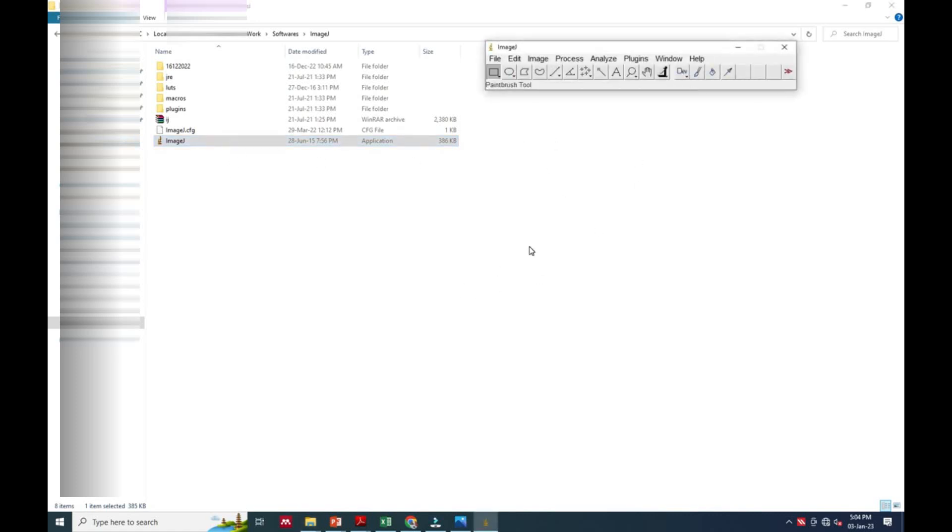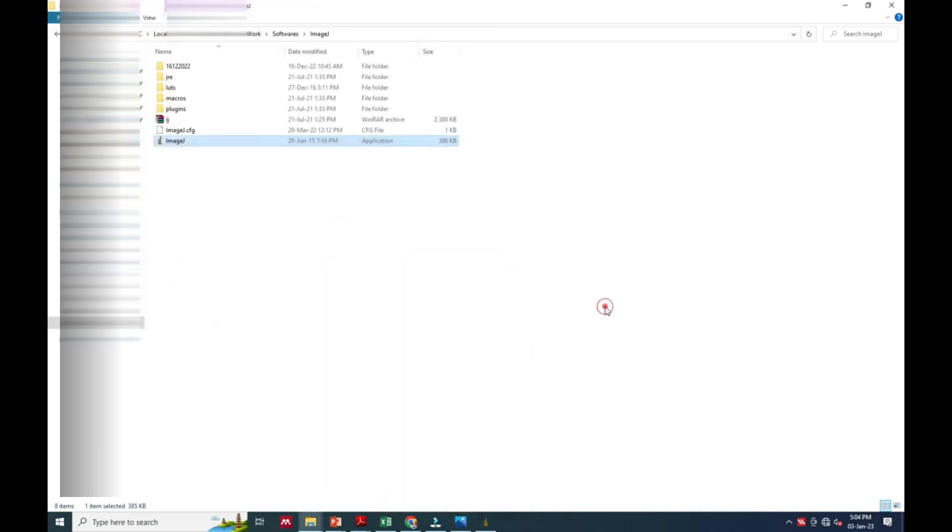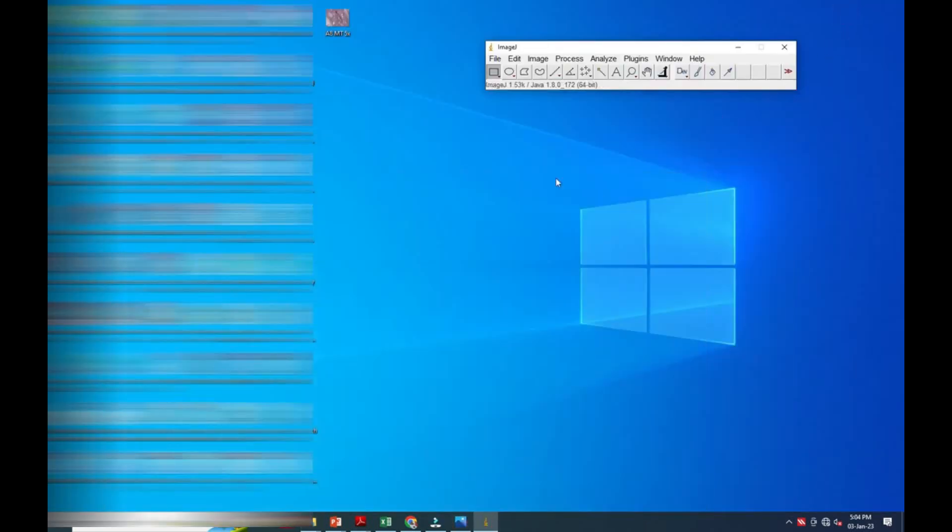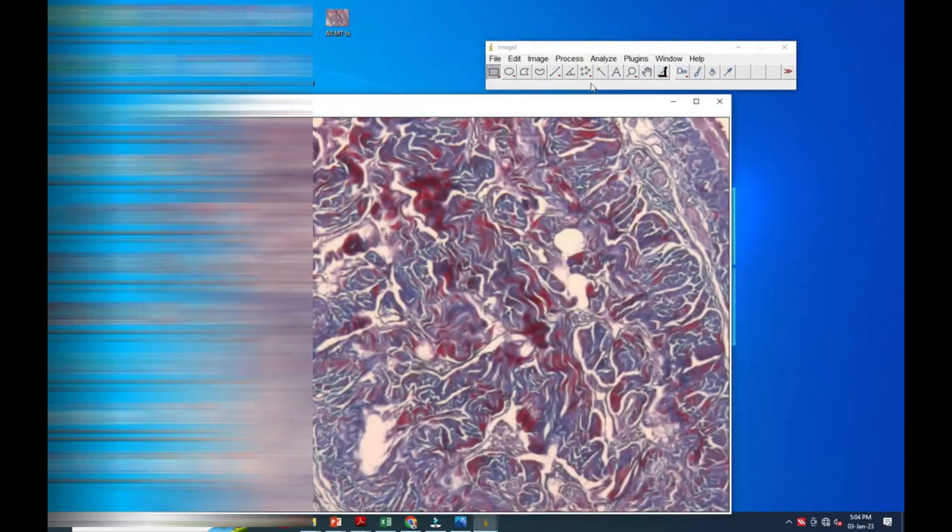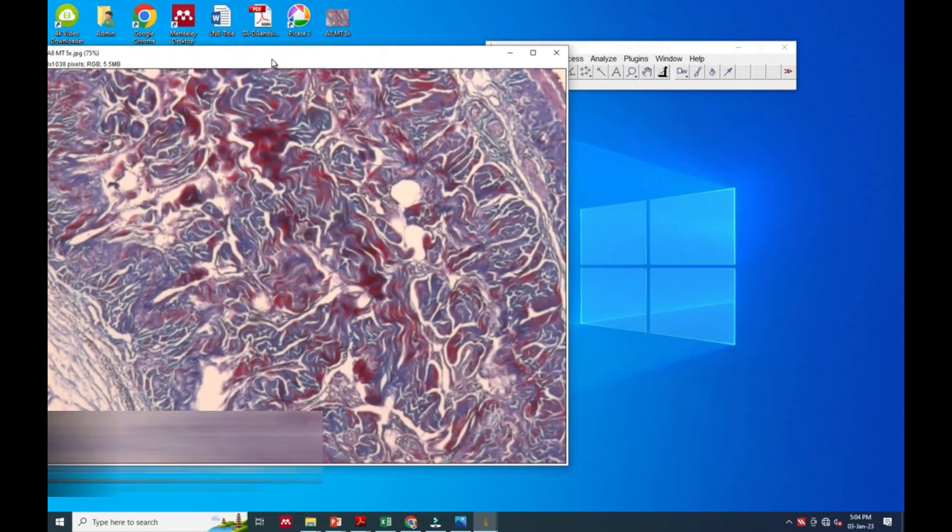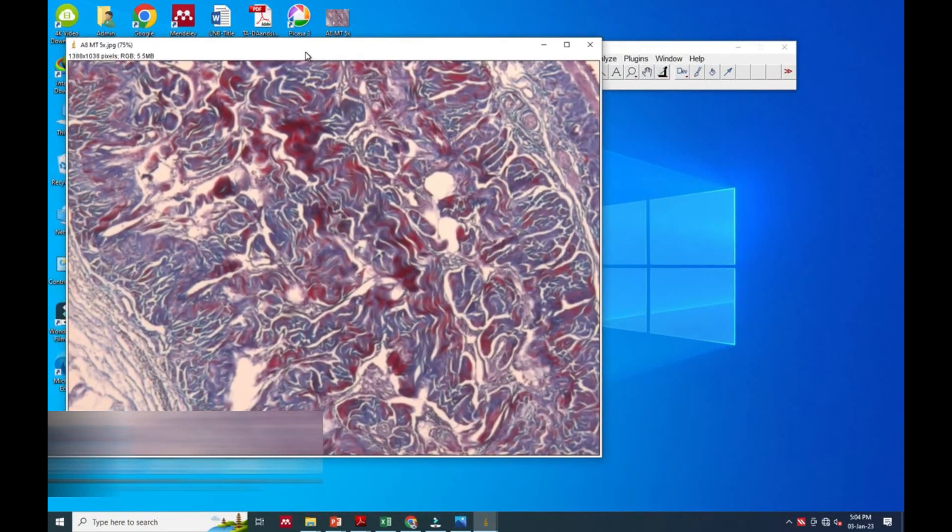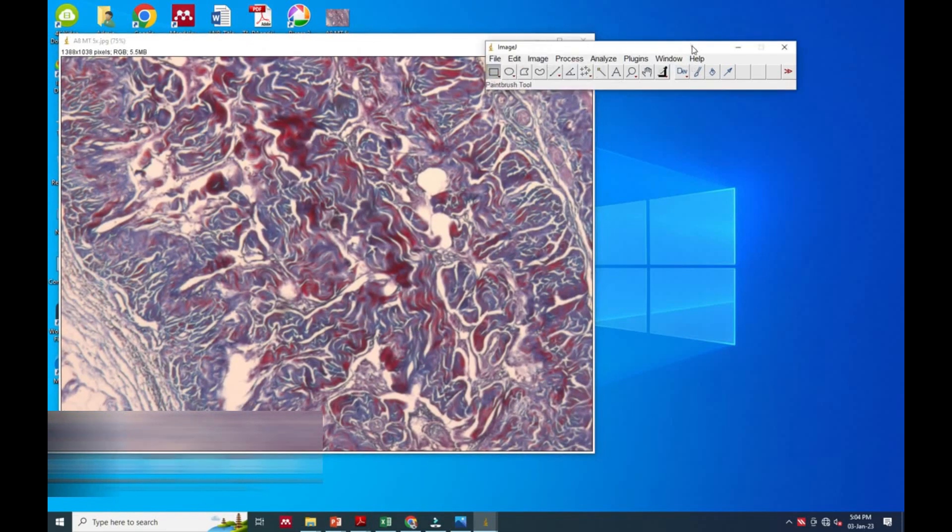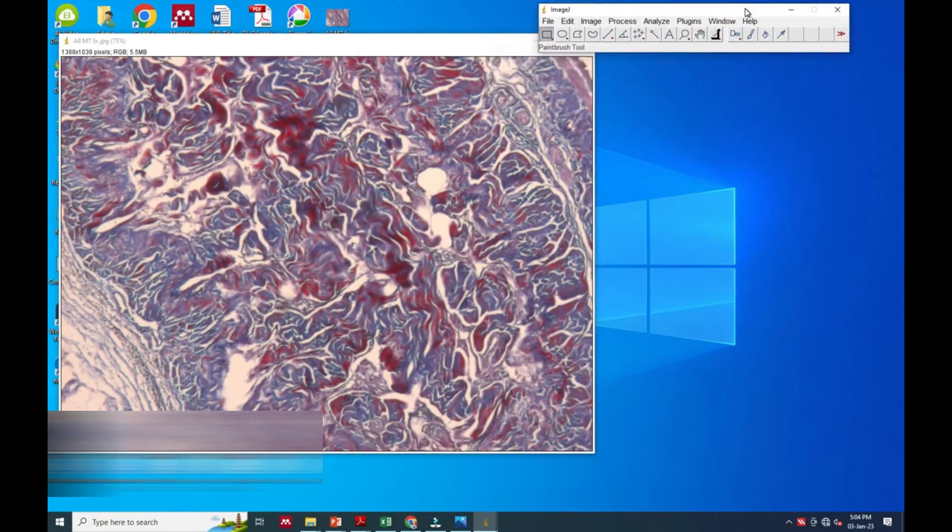We have to now bring the image into ImageJ software into that square. We have to put it in that square. Now you can see it has opened the full image.